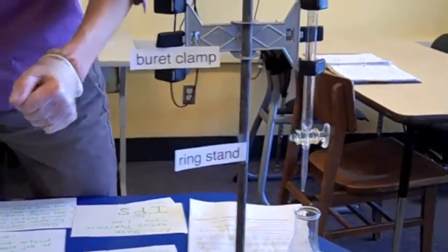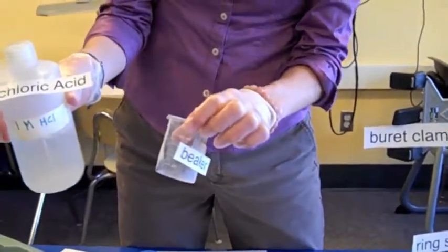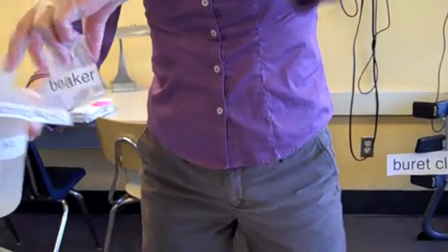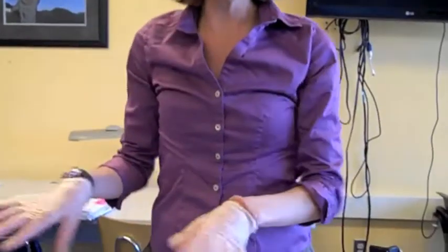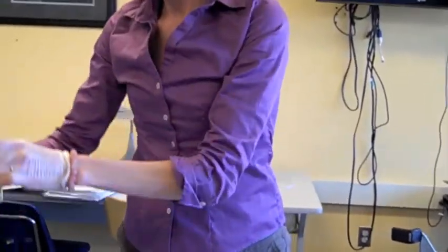We have a beaker right beside. Thank you. A beaker for measuring 50 mils of hydrochloric acid. So we definitely wear gloves and wear goggles for this part. You don't want hydrochloric acid in your eyes. Unscrew the hydrochloric acid, pour in 50 mils. That's the line between the 40 and the 60.